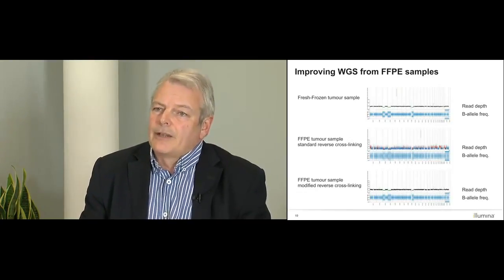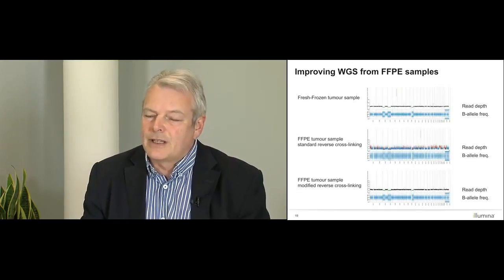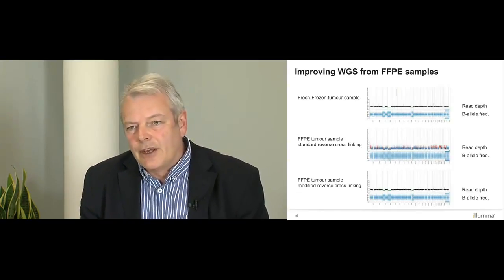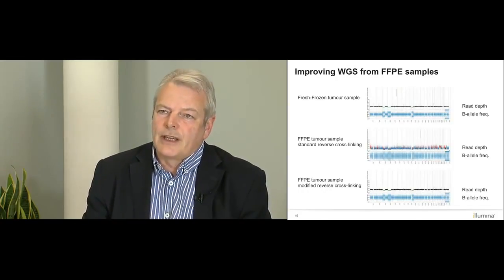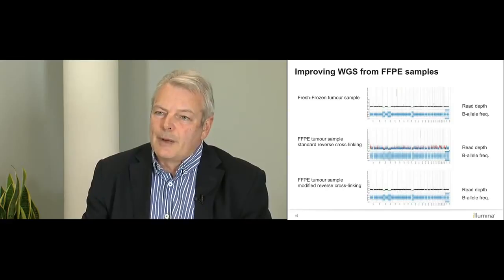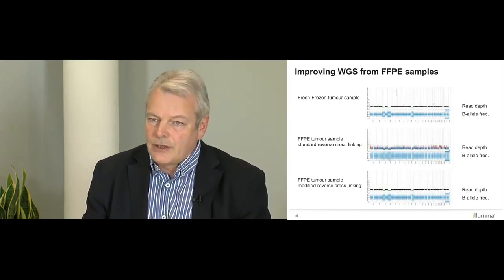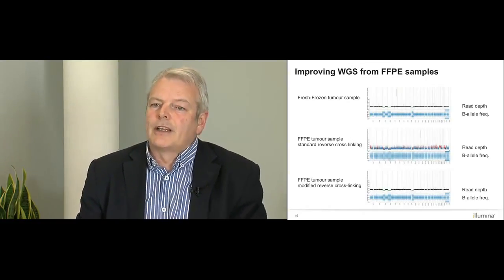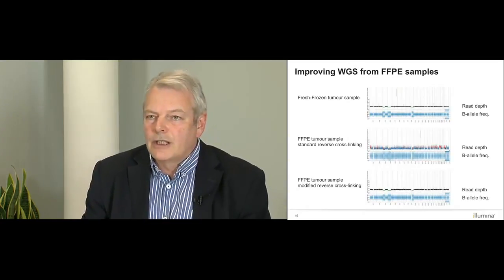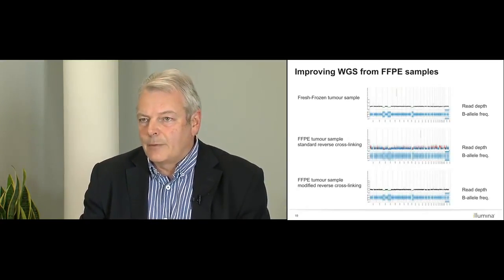In a separate part of this collaboration, all the upfront methods for fixing the tissue in the first place and embedding are also undergoing review, and it may be entirely possible to amend or improve the early stages of this process to the benefit of the DNA quality that comes out without compromising the histology information, which is also important. So watch this space. FFPE certainly has been a challenge, but we get good whole genomes from a wide fraction of the whole genome of the FFPE samples.